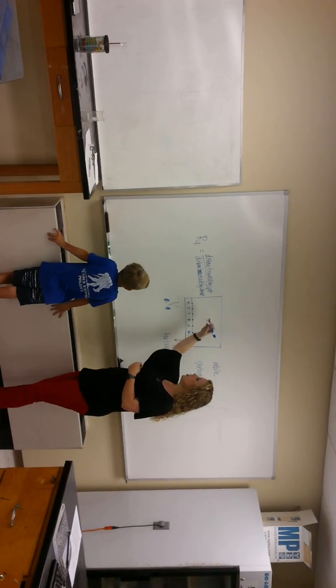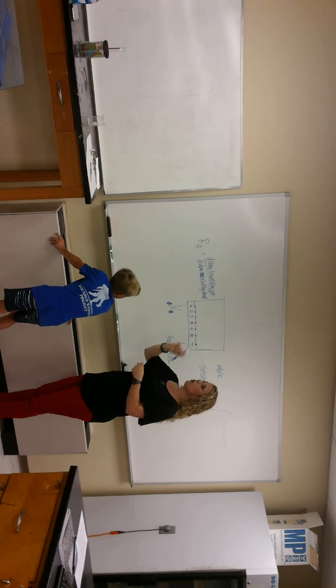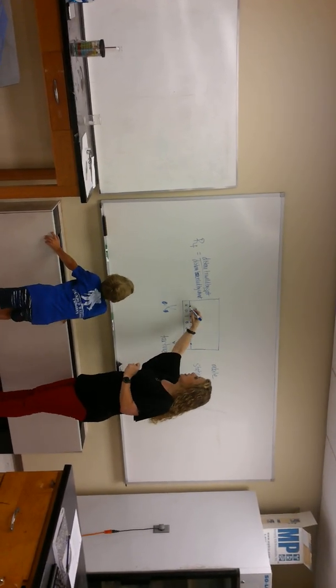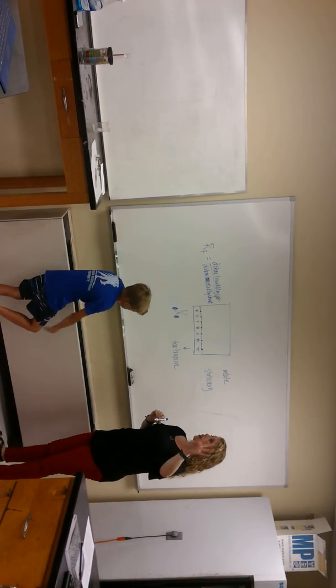So what you're going to want to do is spot it, let it dry, wave it around, put it under the heat lamp. We've got hair dryers you can use. Then spot it again. Let that dry. You want to do that 4 times to get it concentrated.